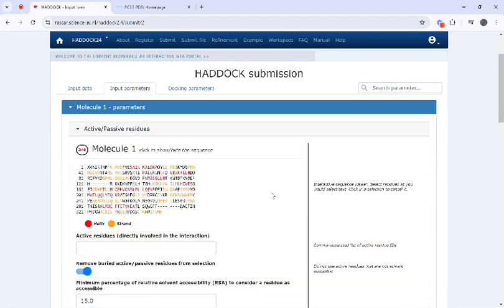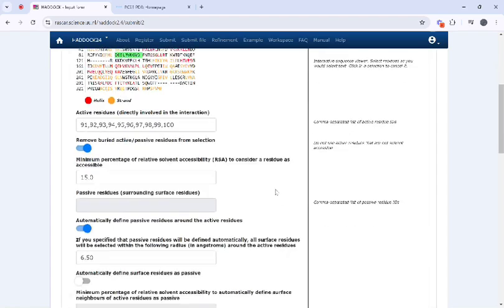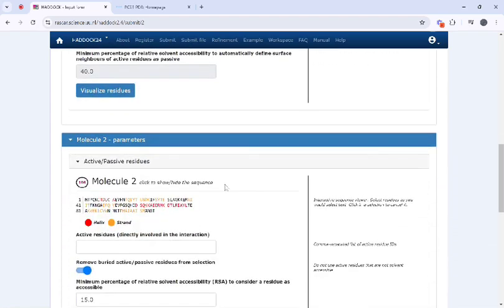In HADDOCK you need to specify active and passive residues. These are critical for guiding the docking process. Here I am selecting residues as active or passive residues. You can select based on your protein structure and based on your analysis.